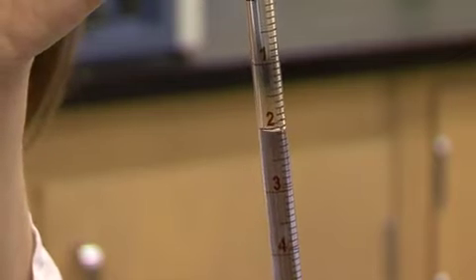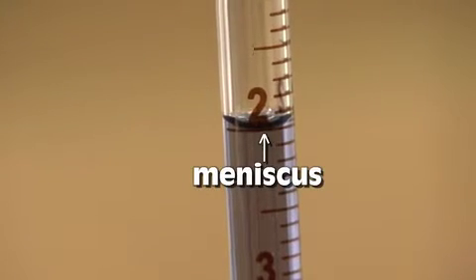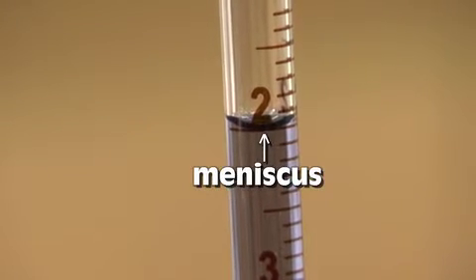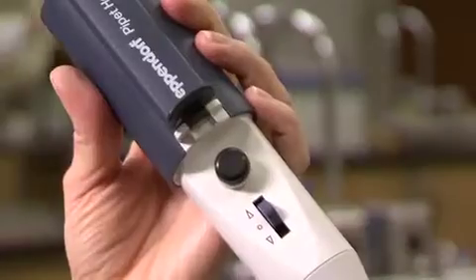As you draw up the desired liquid, try to take your reading with the pipette in a vertical position so the meniscus will lie flat.